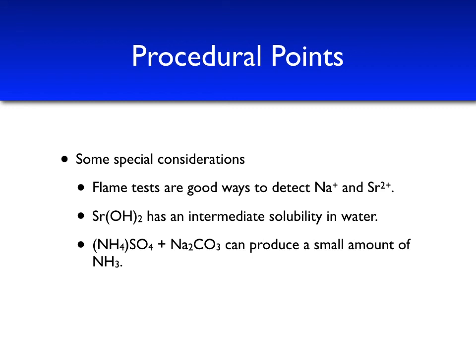The ammonia gas that's formed does not give us as strong an odor as adding ammonium sulfate to sodium hydroxide.